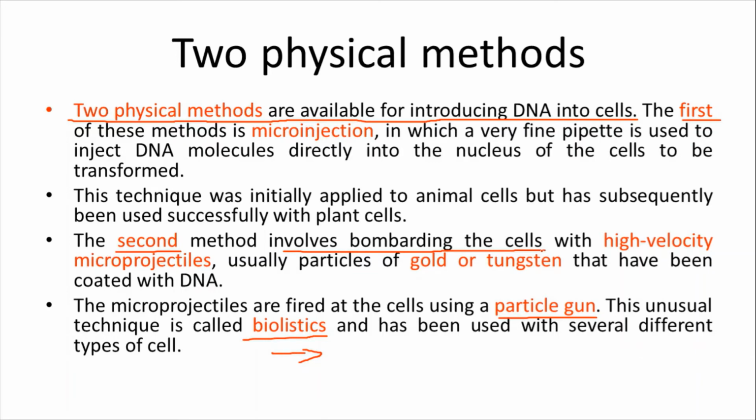After placing the host cells on the plate, the high velocity microprojectile is used. It looks like this. This is a plate, and here is our host cell.